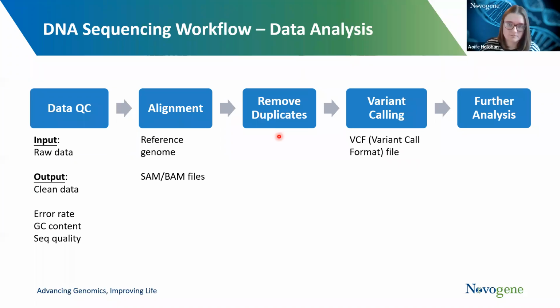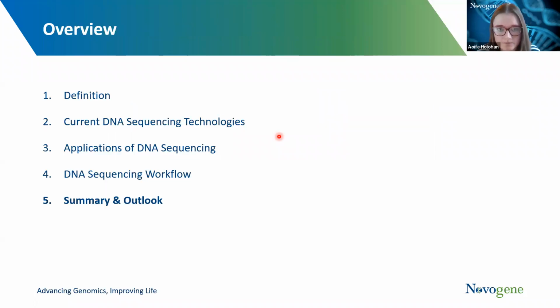Okay, thank you. Yeah. So I think maybe final question now. This is saying somebody is studying algae and considering long read sequencing. Would you recommend long read sequencing using Oxford Nanopore technology for this application?